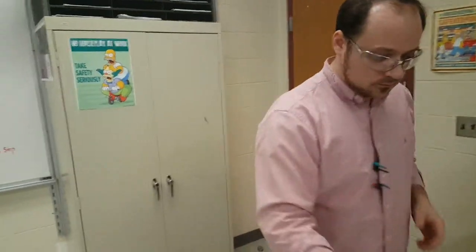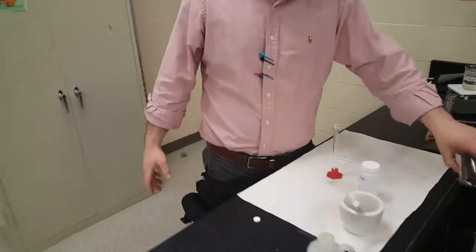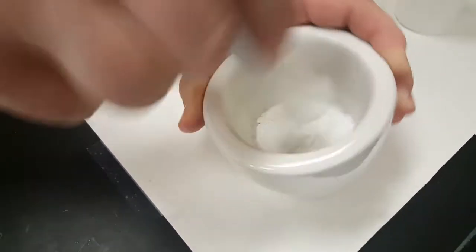We got one more. We got to grind it, yeah. Oh, right, I forgot about that. Yeah, we forgot. It's okay. Particle size. So we got to do the grinder. Toss a whole tablet into the mortar and pestle, and you grind that sucker up. We want powder. Yeah, a little crush and then a swirl, crush and swirl, crush and swirl. There it is. There's the swirl.